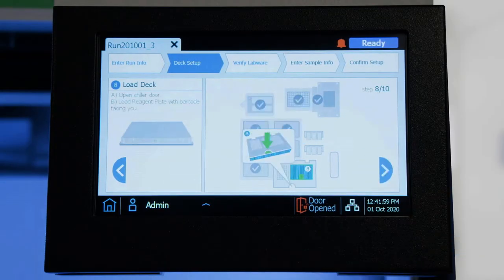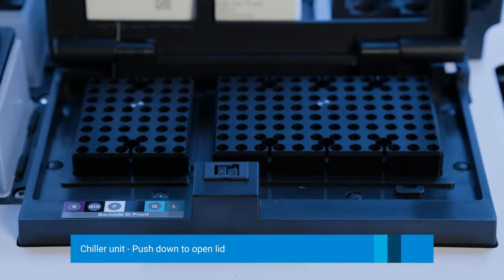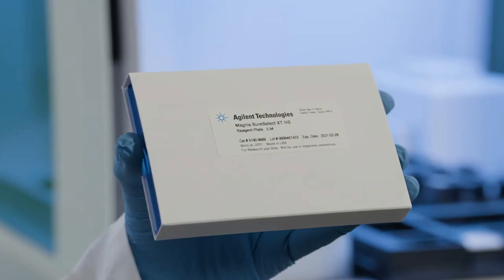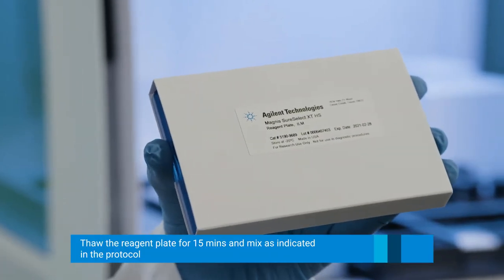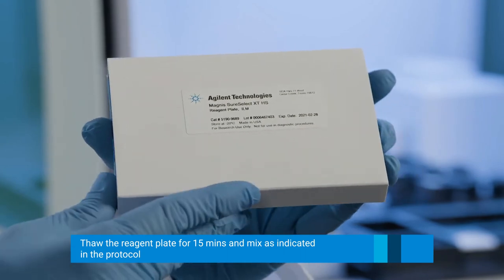Next, we will be loading the chiller unit. We have to open the door of the chiller by pushing down on it, releasing the latch so it opens. Now you have your reagent plate. This reagent plate is in the minus 20 freezer. It also needs to be thawed for about 15 minutes and mixed in a similar manner as indicated in the protocol.